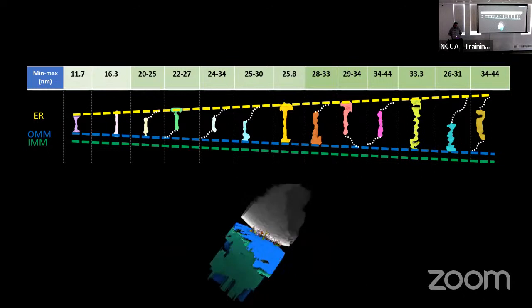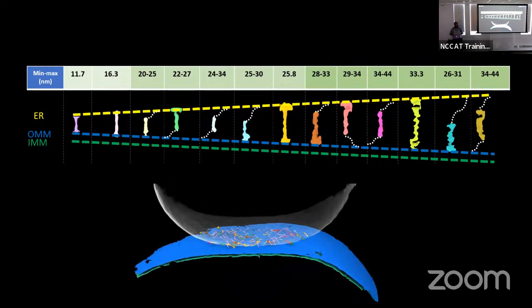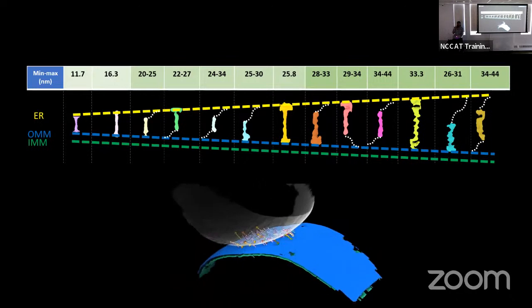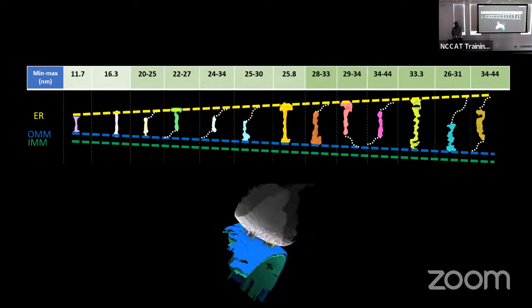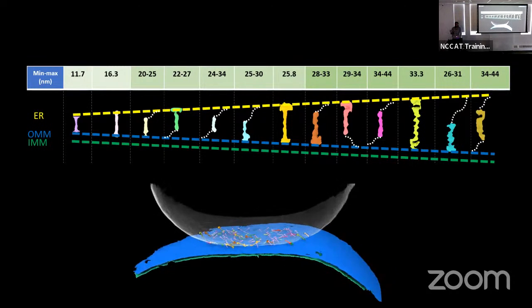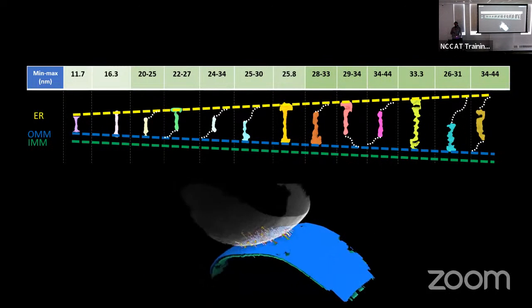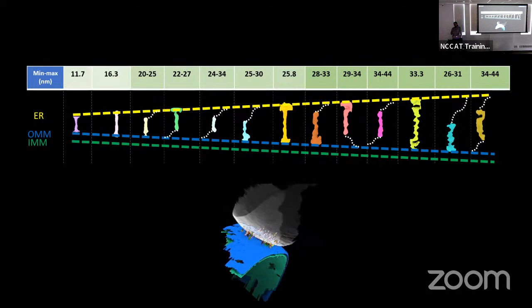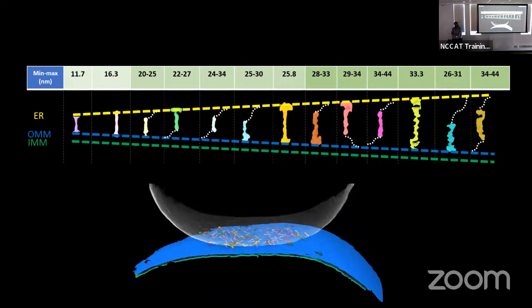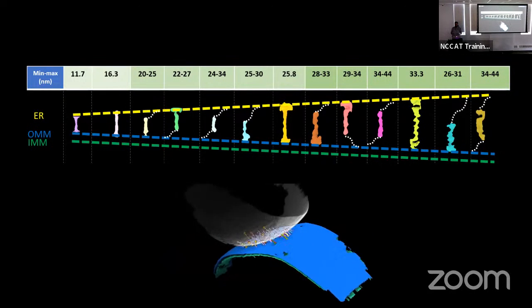Those are actually physiological holes, some of them at least. They're actually all over the place, but that's a great point because, like I said, lipid transfer happens at ER contact sites. So to create these cristae, you would think that it should be close to a site of lipid biogenesis. There's a hypothesis out there that maybe at the contact sites you have more cristae, but that's something I did not see in my data. I saw a null effect. There was no huge difference between contact site and outside contact site.